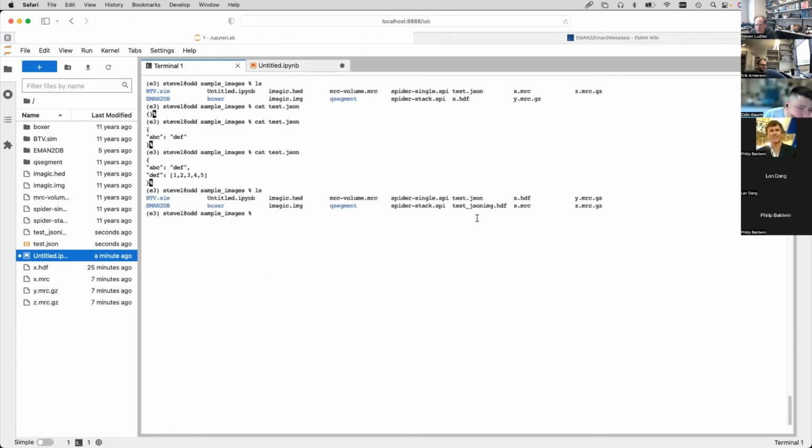That's where these JSON image files come from. So originally, when we did this JSON stuff, we actually just embedded the image in the JSON file, but that produced these humongous text files, which weren't really very human readable anymore. So we changed the mechanism.